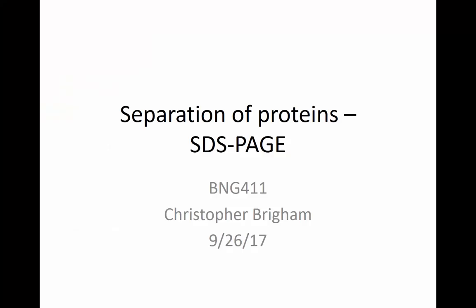Hello, BNG411 class. This is the recorded pre-lab lecture for next week's lab, starting the 26th, on the separation of proteins by SDS-PAGE. A couple of things to note. First is that I'm not around next week, so this is why I'm recording this and posting it on my courses. So please watch this before your designated lab.